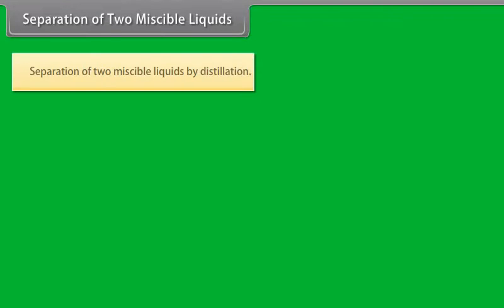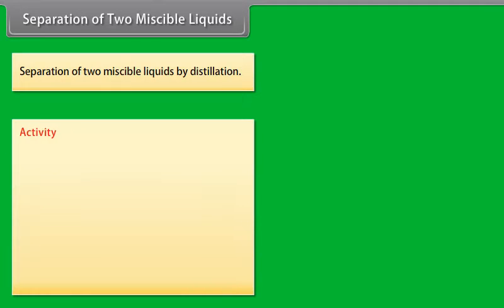Separation of two miscible liquids by distillation. Activity.